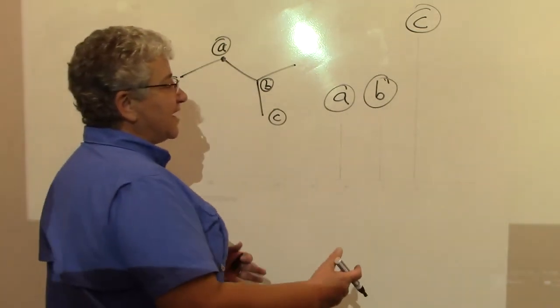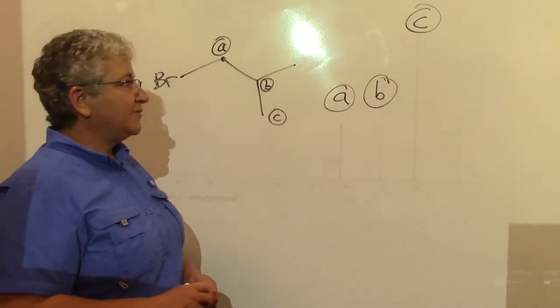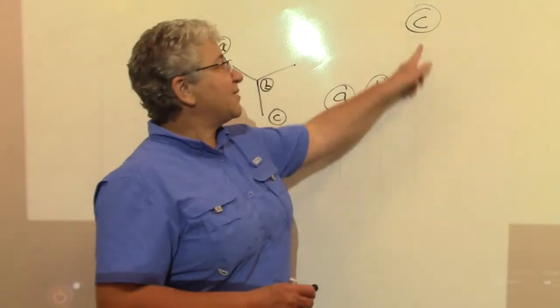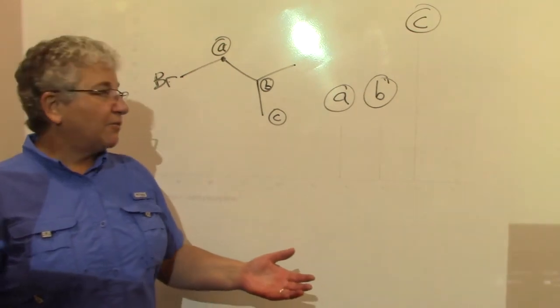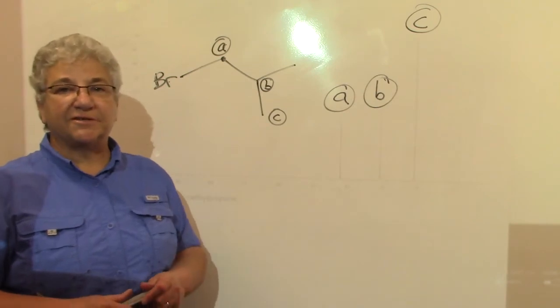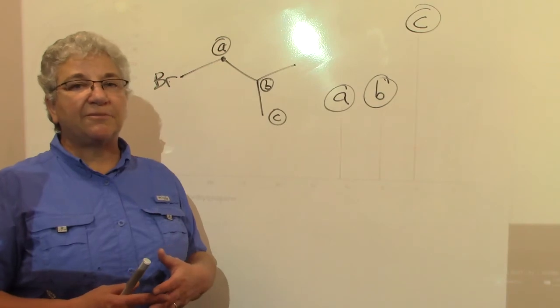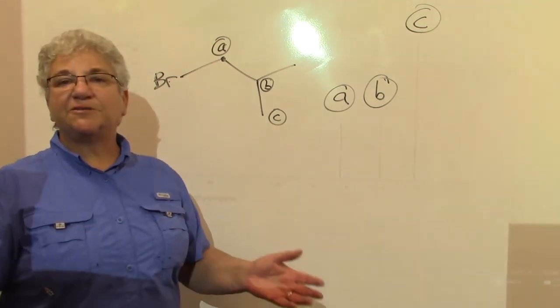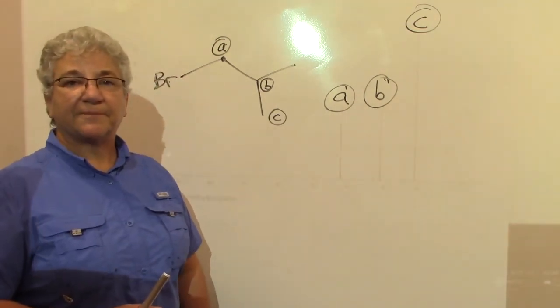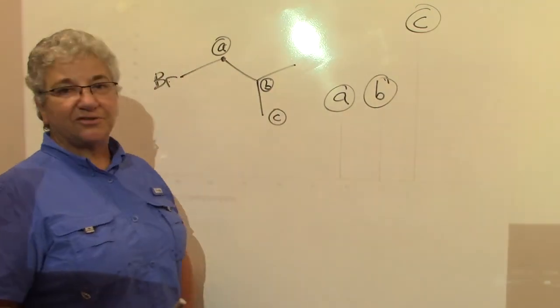Some of you might say, oh, these peaks are differently sized, which is true. And so you might say, well, C is really 2 carbons, and so I would expect the taller peak to be the one that represents 2 carbons. And sometimes that works. Sometimes it doesn't. In proton NMR, we call that integration, and it really does work in proton NMR. In carbon, it sometimes depends, so don't rely on it, but certainly in this case, you could have used it. I don't tend to rely on that. I tend to pay attention to chemical shift and structure of my molecule.